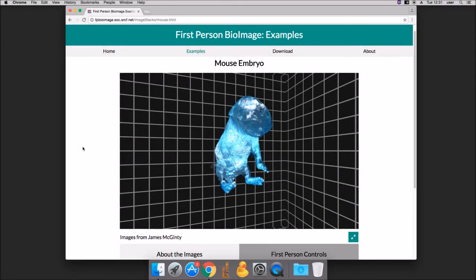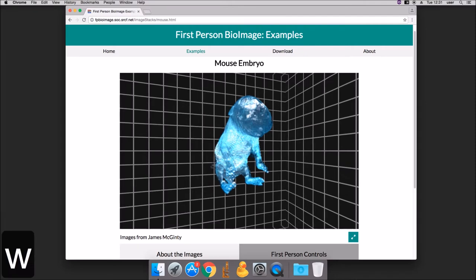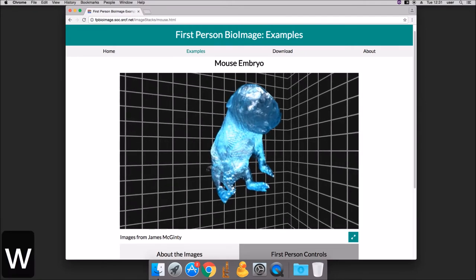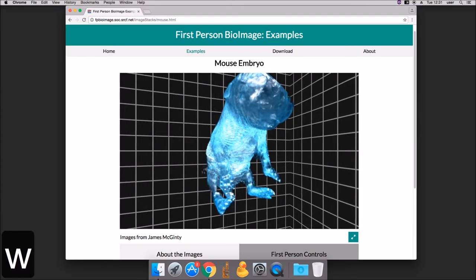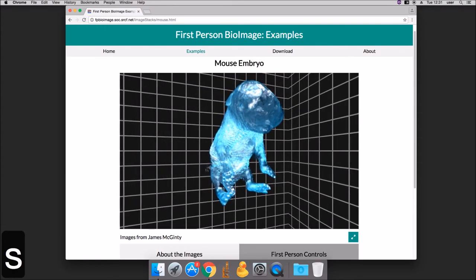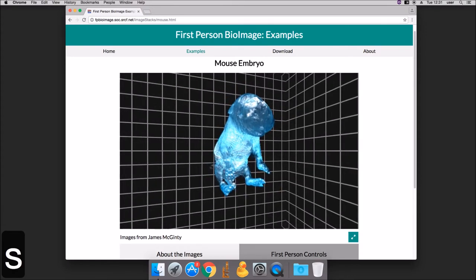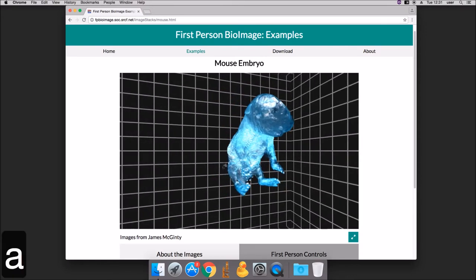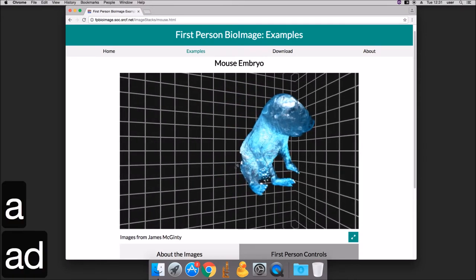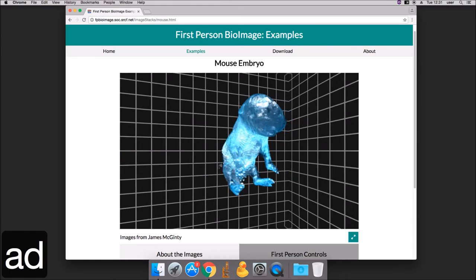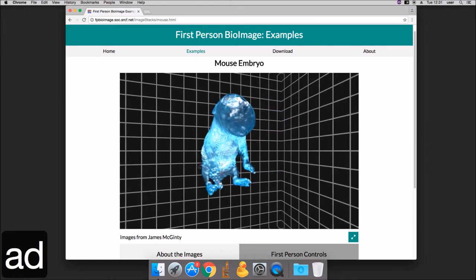The W, A, S and D keys are used to move the camera around the model. W moves you forwards, S backwards. A will move you to the left, and D will move you to the right.